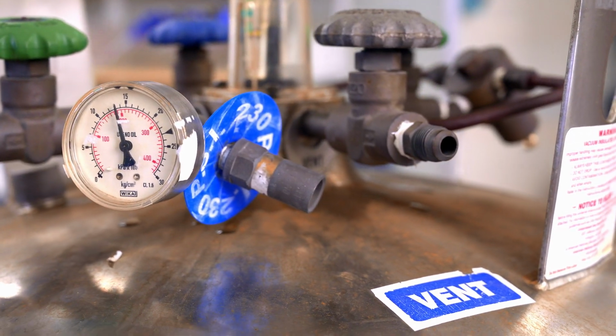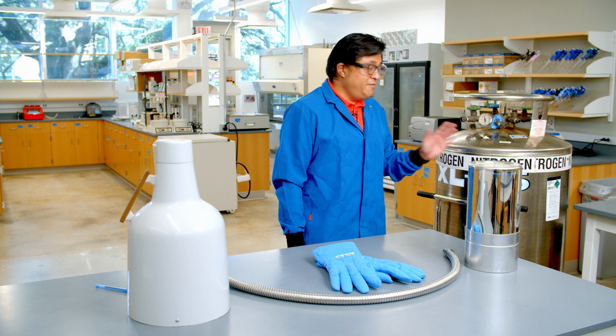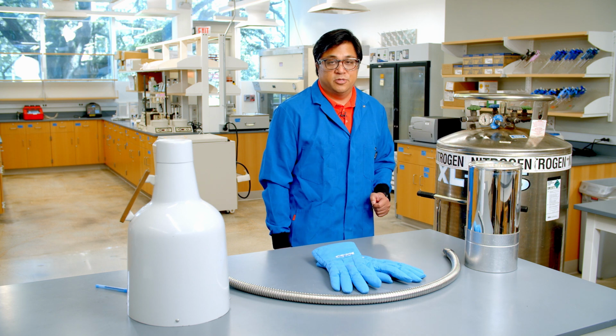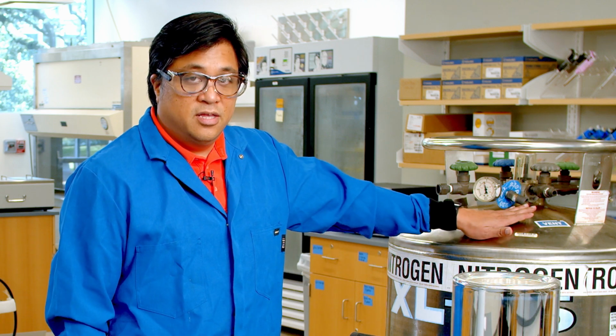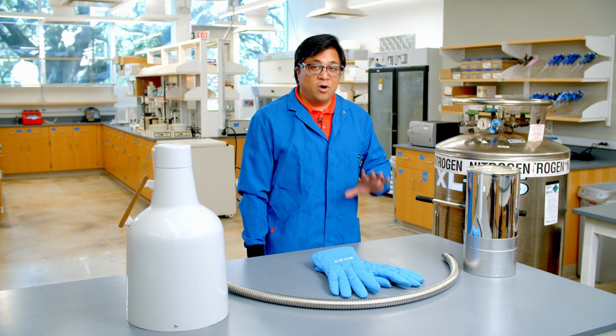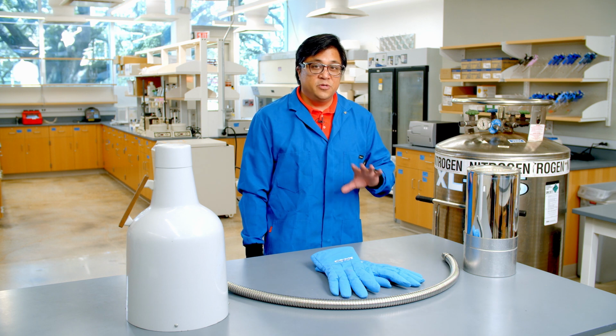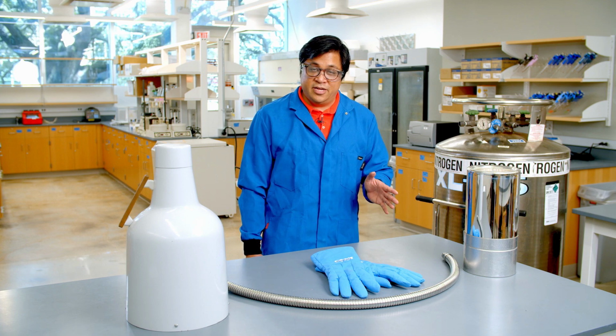It might be a sudden release or a very slow release. But it's important not to be alarmed. It's a safety feature and it's doing exactly what it's supposed to do. It's important never to tamper with or block this valve. Now, if this valve is frozen open, you can use water to defrost it, but do not use any external heat source. If you're unsure about this procedure, you can contact Rice EHS.